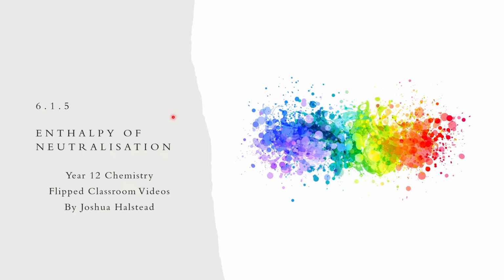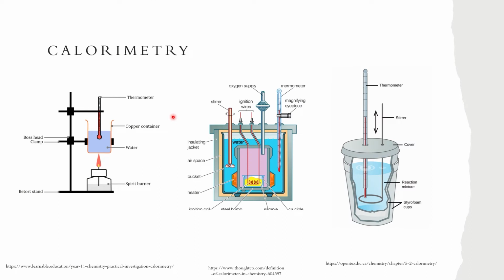G'day chemistry students. In this video, we're covering dot point 6.1.5. In particular, we're looking at the enthalpy of neutralization and how to measure it. Let's get into it.